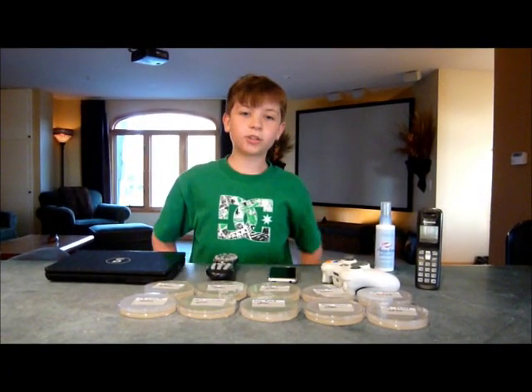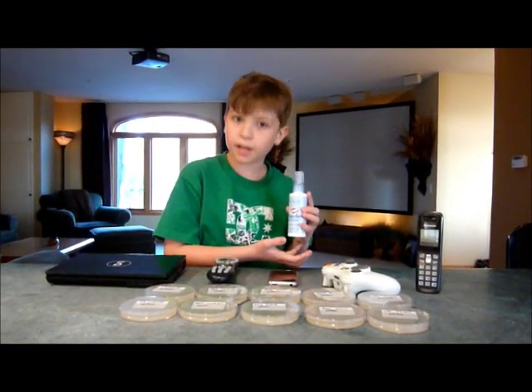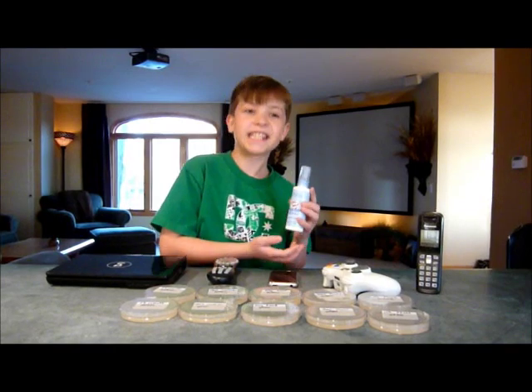I'm going to find out if the Clorox Anywhere Hard Surface Spray really kills 99% of bacteria like it says.